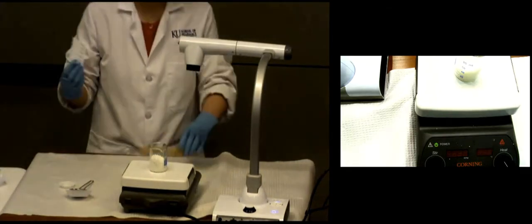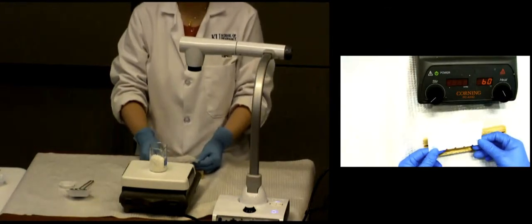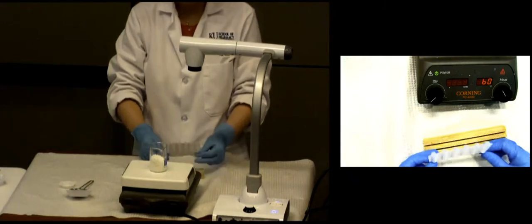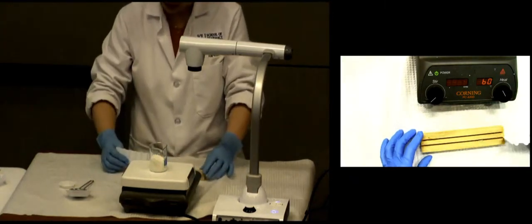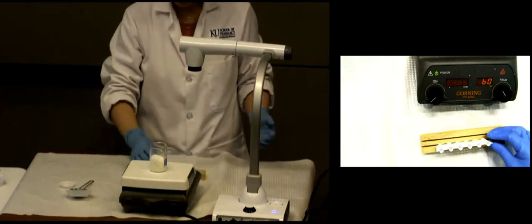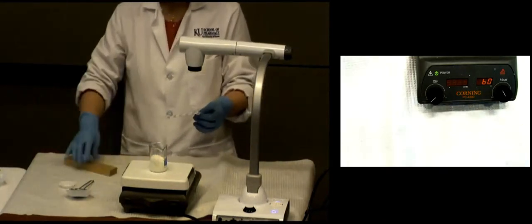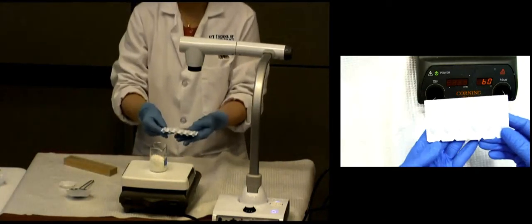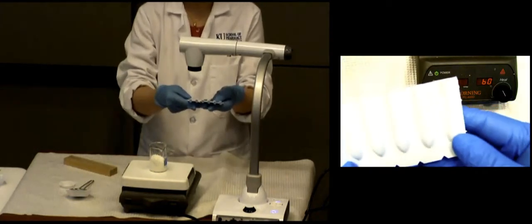Meanwhile, for that 20 minutes, of course, you can go ahead and prepare your suppository mold. For the dry lab, we're going to use a plastic one. The plastic one doesn't quite sit, therefore you need a stand on the bottom. You can slide in the plastic one and it sits like this. Now, what's handy about the plastic one is, if I can, it doesn't quite show well. Okay, that's why we probably need a cameraman.